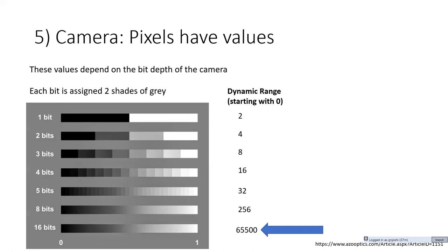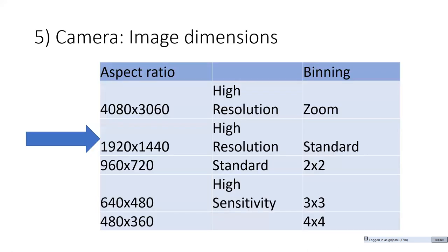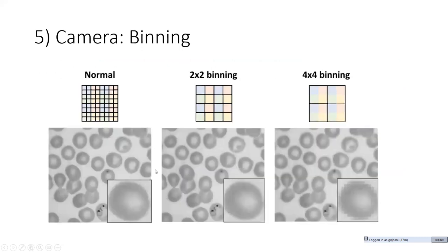And that's what the Keyence gives to you, okay? Now, the other thing is, when I showed to you that you can start with the high resolution of 1920 by 1440, which means you have 1920 pixels in X direction and 1440 pixels in Y direction. So if we look at a normal image, we will have, let's say, 1920 by 1440 pixels, assuming that.